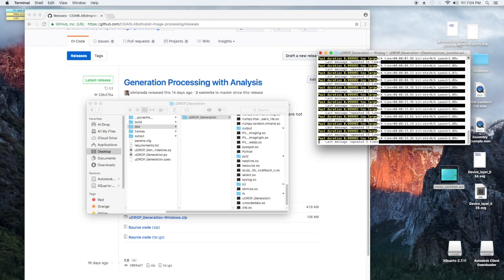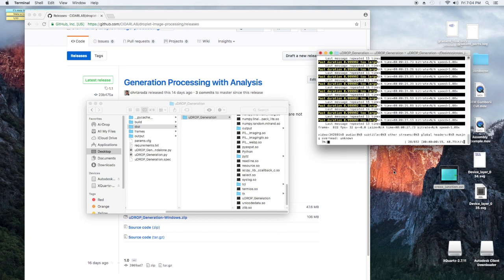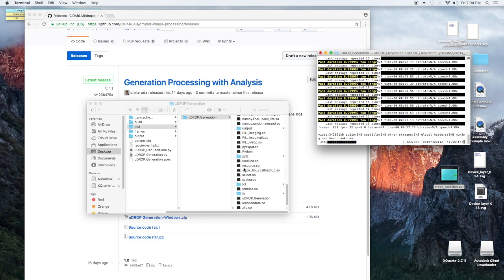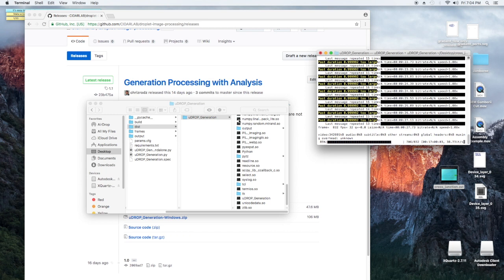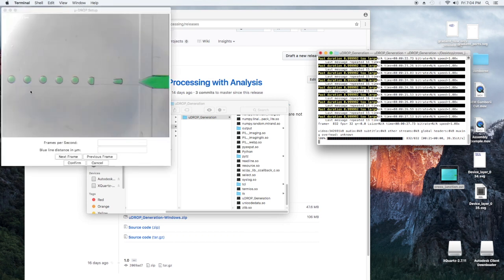Remember that to use this program you need to download ffmpeg. This is going to fail if you don't have ffmpeg available to use as a command line tool. You can look up how to download it online, both for Mac and Windows, it's super easy, and it's super useful outside of this, any time you're doing anything with videos. If you don't want to use ffmpeg, you can use whatever you want to split this into frames, and just put into a folder called frames in the same directory as your executable, and then you can just call the executable with no arguments, and it'll just use the images you put in there. But I like ffmpeg because it takes away the complication of splitting it into frames.